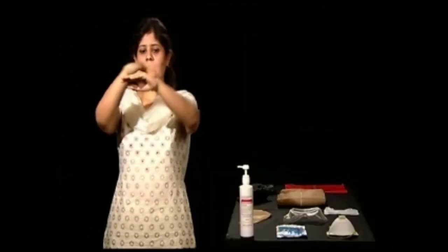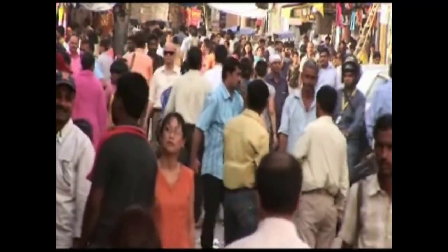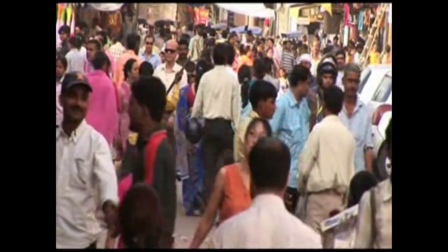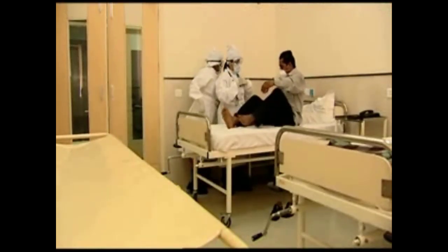The well-being of the nation largely depends on the safety of the medical workers who toil hard in the field and labs across the country to combat infectious agents. The correct use of personal protective equipment strengthens their resolve by keeping them safe from the very infections they battle.